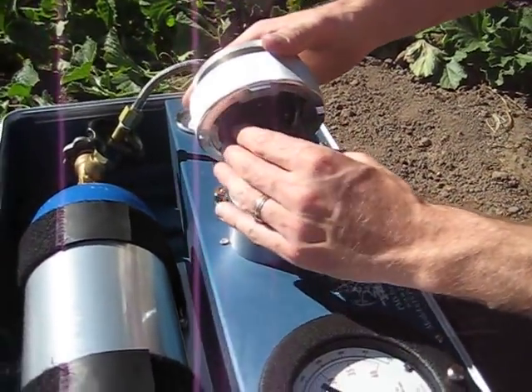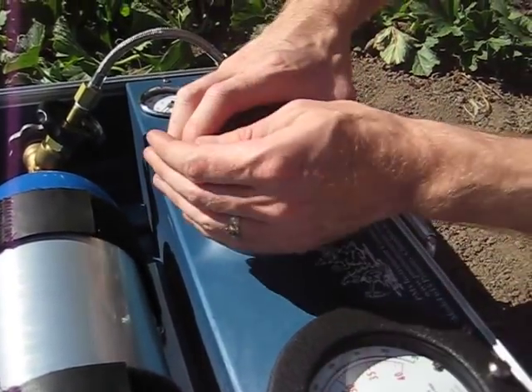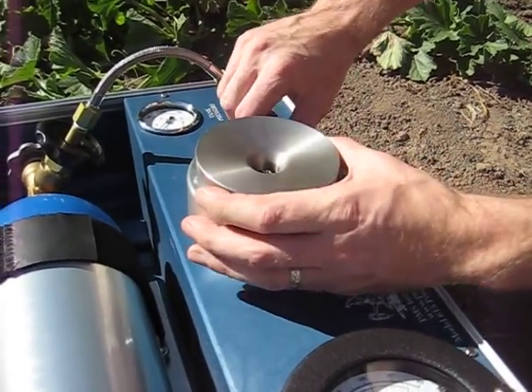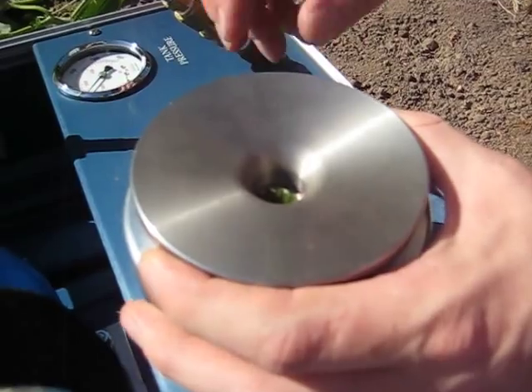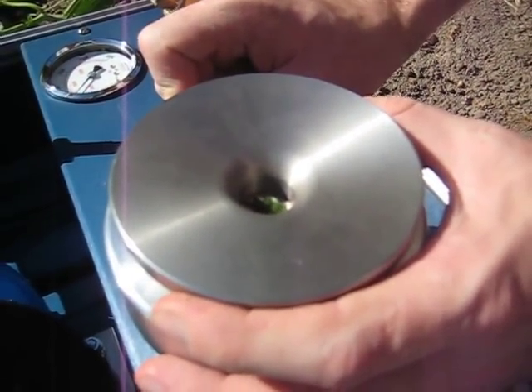The whole bag and everything goes down into the chamber. It's locked in the chamber, and we begin to pressurize the chamber. What we're looking for is just a little water to come out, and what we have to do is just normally watch that center rib.